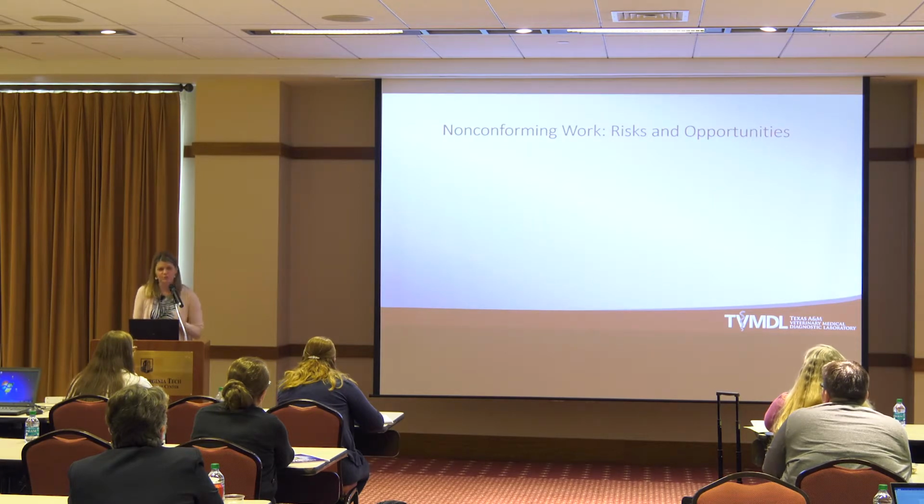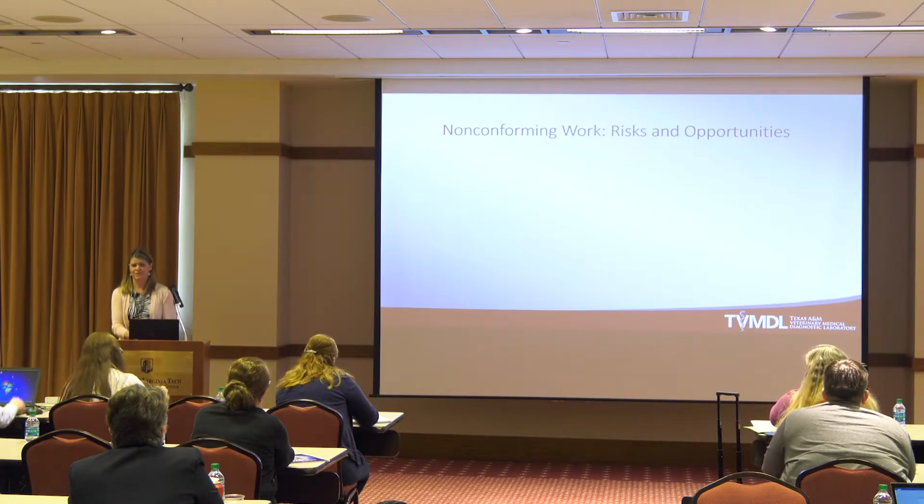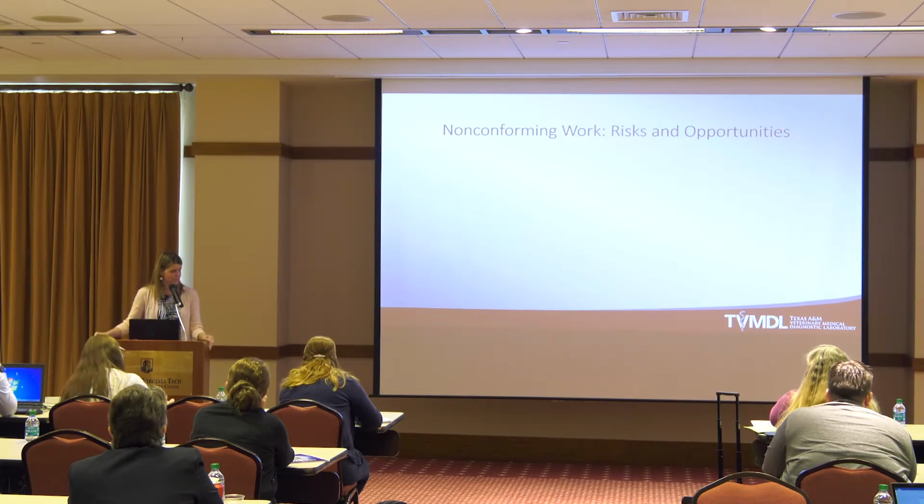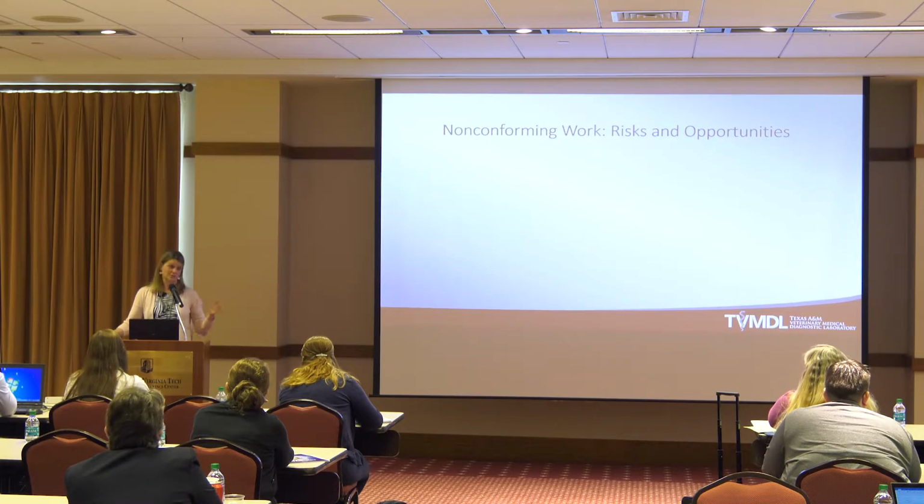All right, so non-conforming work risks and opportunities. This was a new one for us. I don't know if we got lucky or unlucky, but the timing of our 17025 assessment was such that we had about 3 months to conform to the new standard. Because it was, what was it, October 1st? Yeah, the cutoff. We were just under the cutoff. If you're before October 1st or September 1st, you can use the old standard. If you're after, you have to conform to the new standard. And it basically gave us about 3 months to get trained and update procedures.